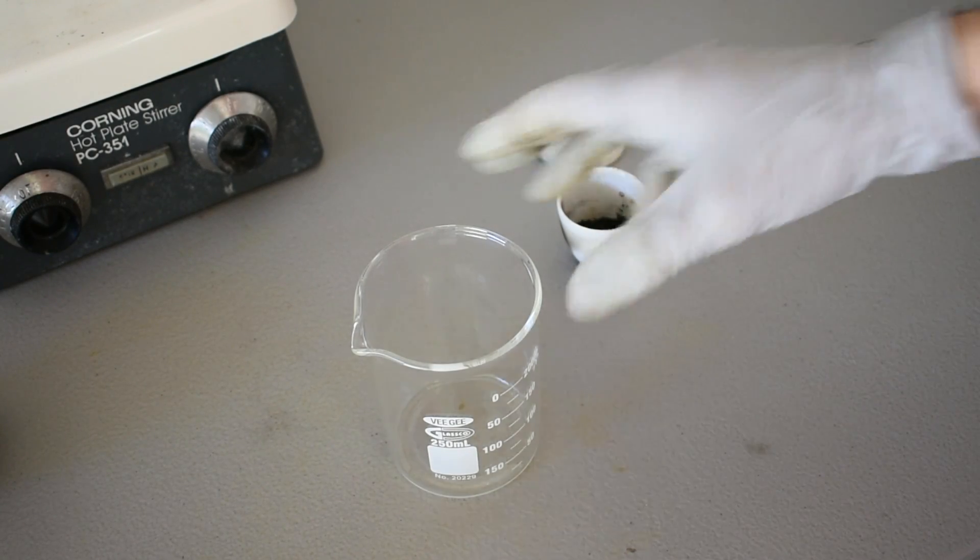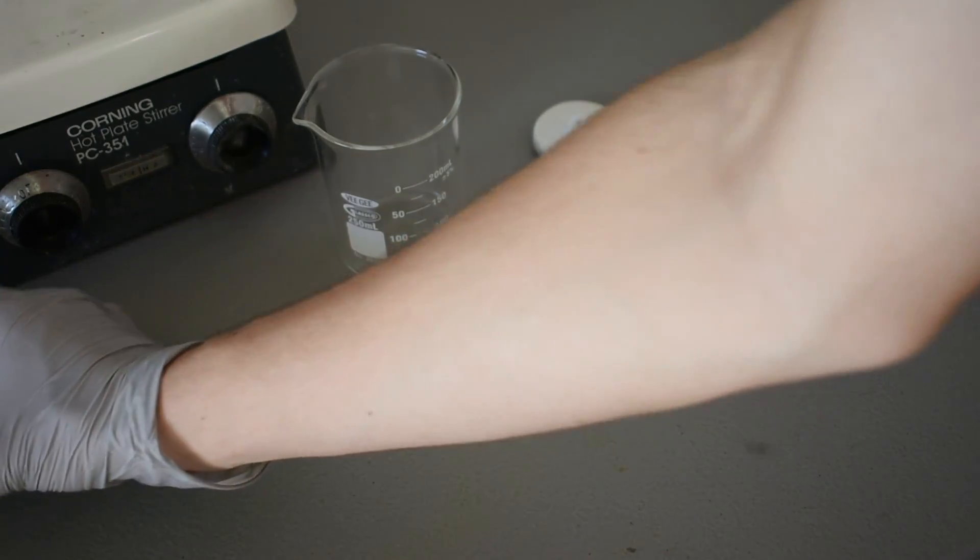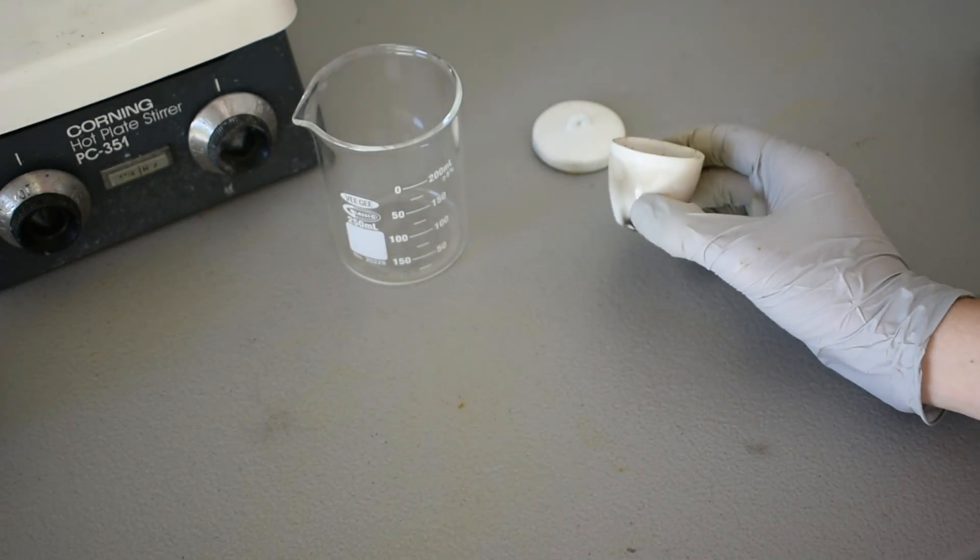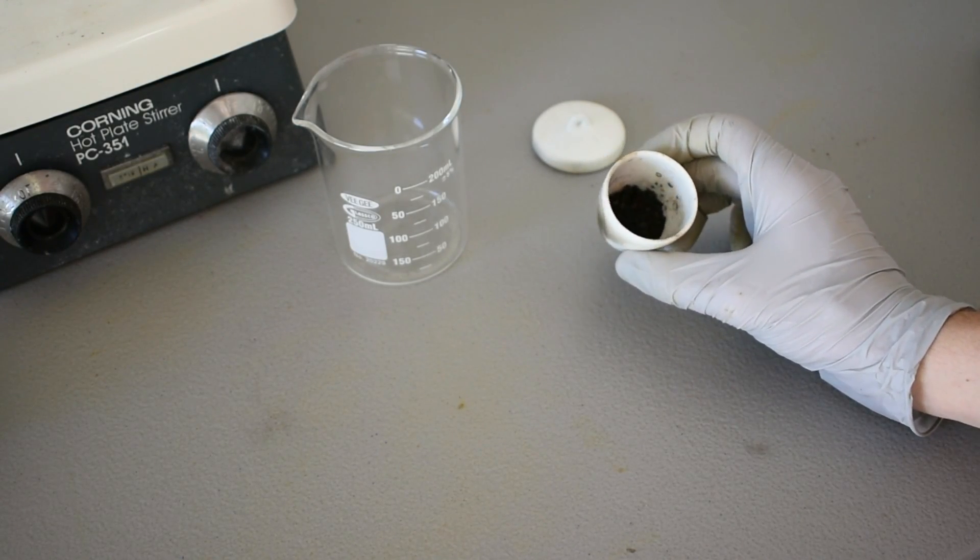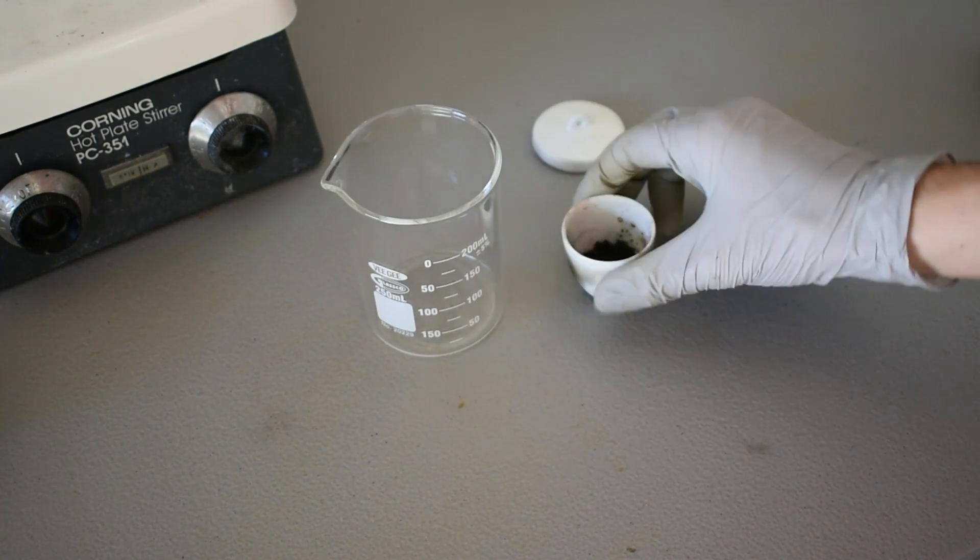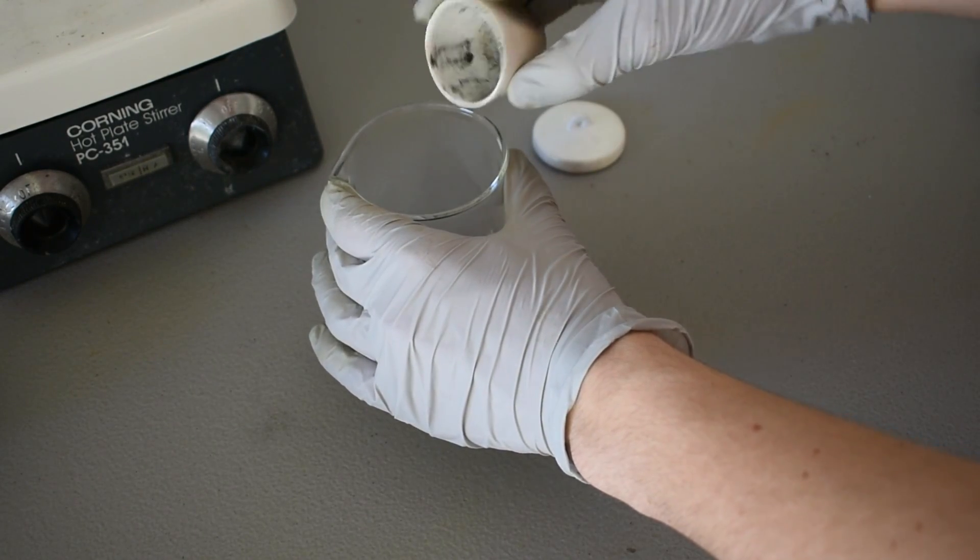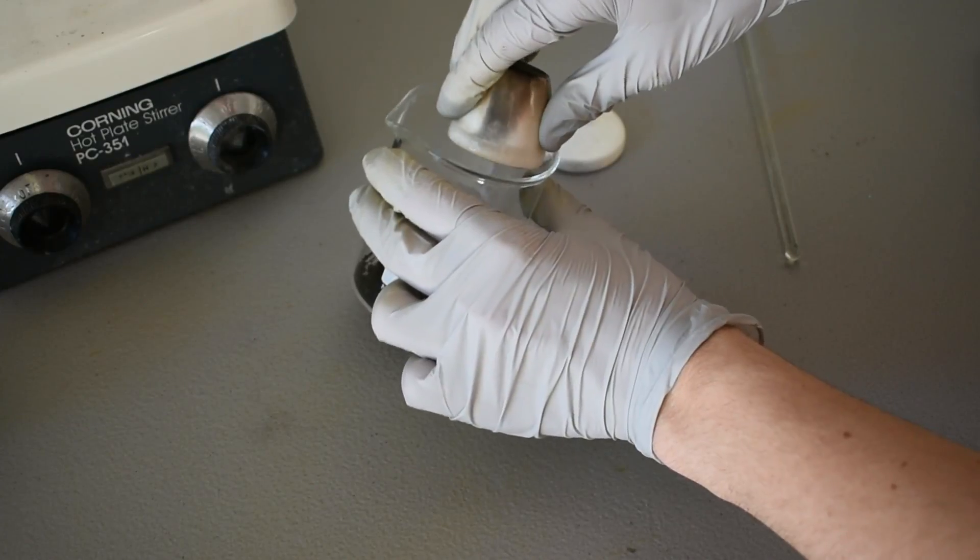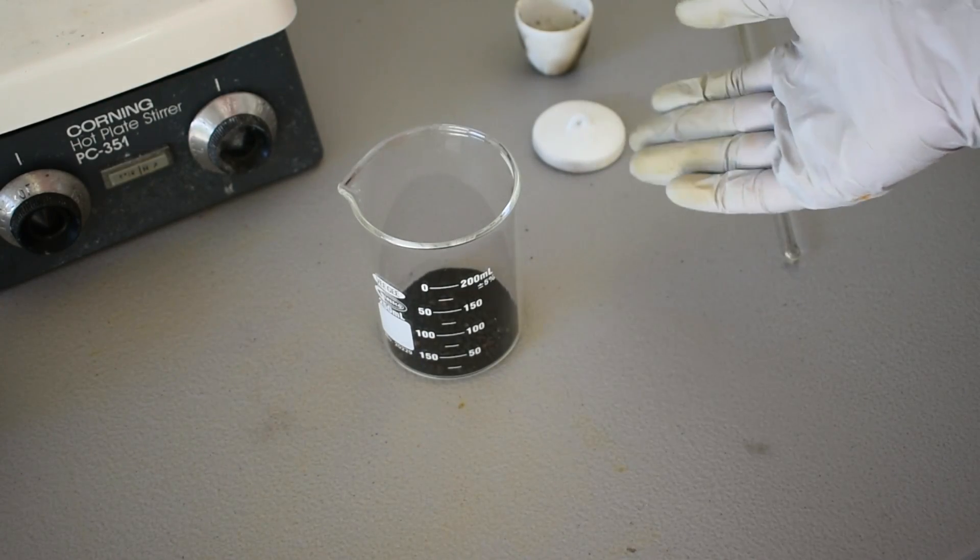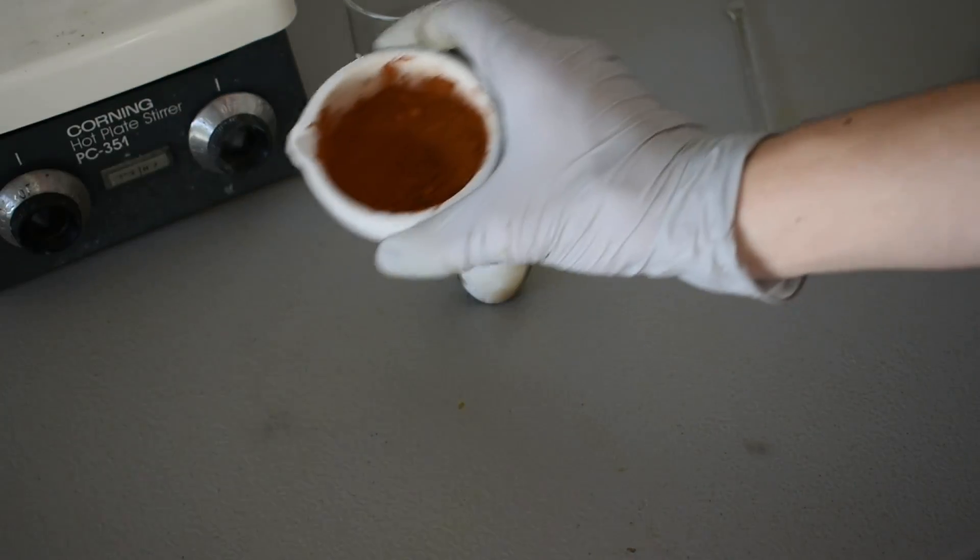Alright, so we're back in the lab. I have our cooled down crucible with our product. It's still a little warm, but it doesn't matter. And while it was cooling, I crushed up the other batch. So now the next step is to rinse our catalyst of any impurities using acetic acid. And I'm going to do that in this beaker. So I'm going to take our catalyst, pour it in. And I'm not going to rinse it yet. I'll rinse everything at once. So now we can load our next batch into the crucible.